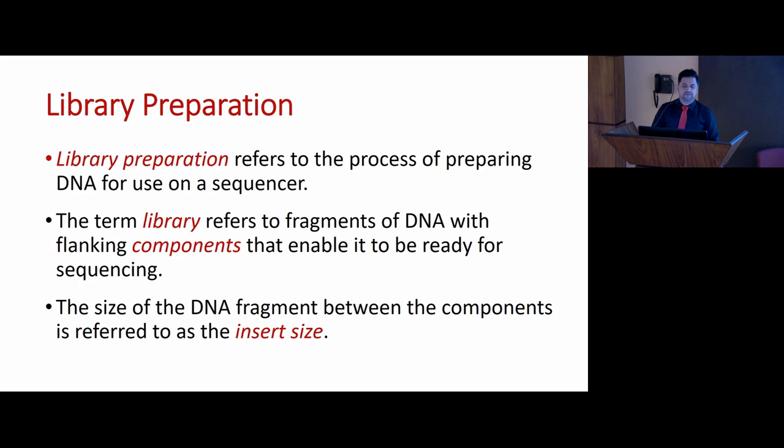Now, how to decide how to prepare your library? Library preparation is a process of preparing DNA for use on a sequencer. Okay, this is how you prepare your sample for use on a sequencer. The term library refers to fragments of DNA with flanking components which enable it to be ready for sequencing. The size of the DNA between the components is referred to as insert size.